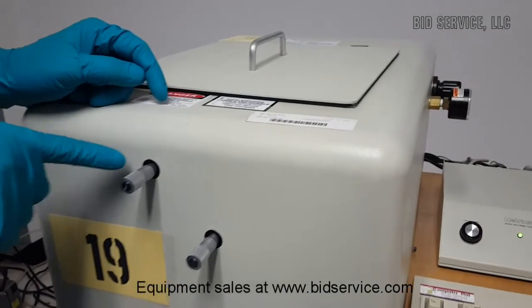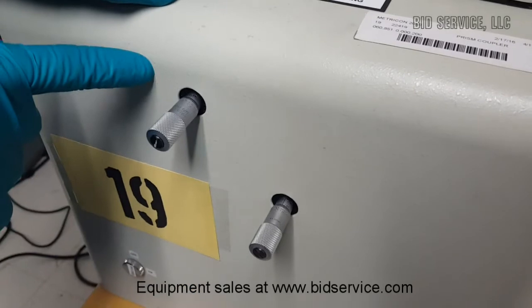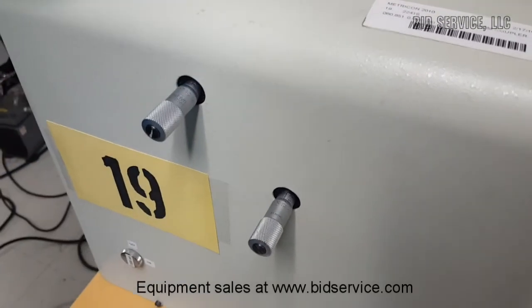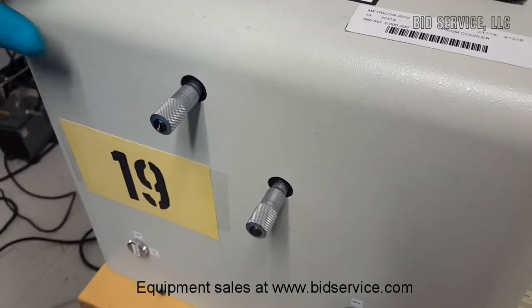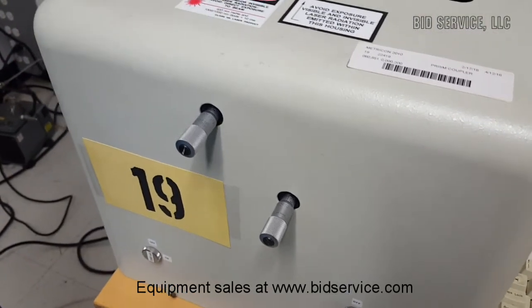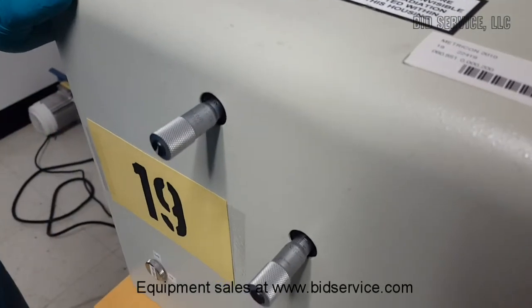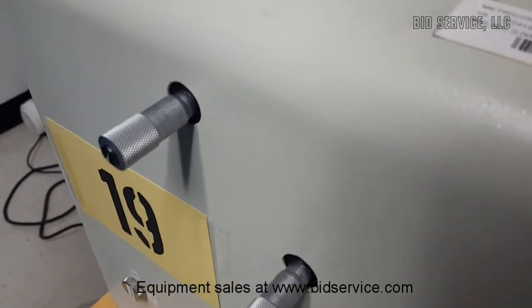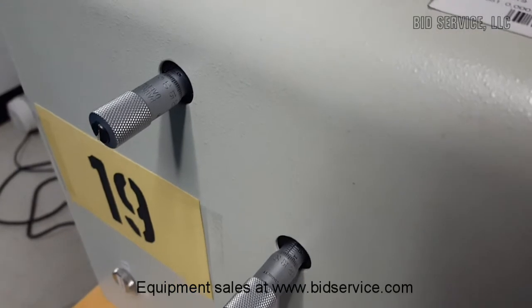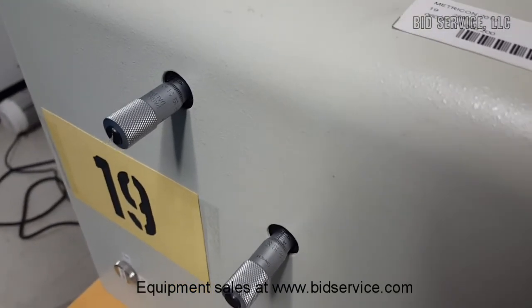The user must record the micrometer positions for both of them here. In order to align the prism, anytime a new prism is used, it may be necessary to move these to align the laser to locate the beam at the proper coupling point.